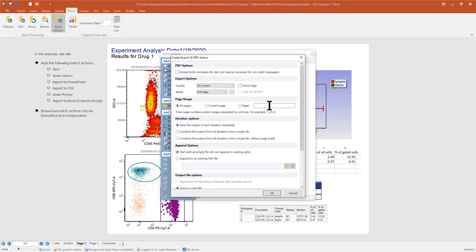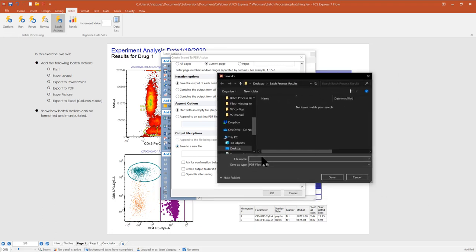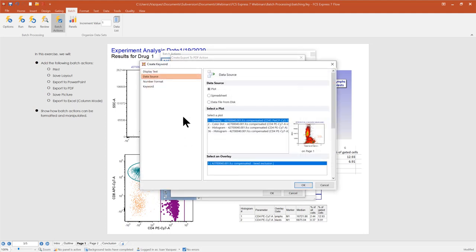The PDF setup is similar to PowerPoint. You can set the quality, mode, which pages go to PDF, and whether FCS Express saves each iteration as its own PDF, combines them into a single PDF, or appends to an existing PDF. Then define where to save the information, and you can also have FCS Express uniquely name the PDF using the same keyword as earlier.